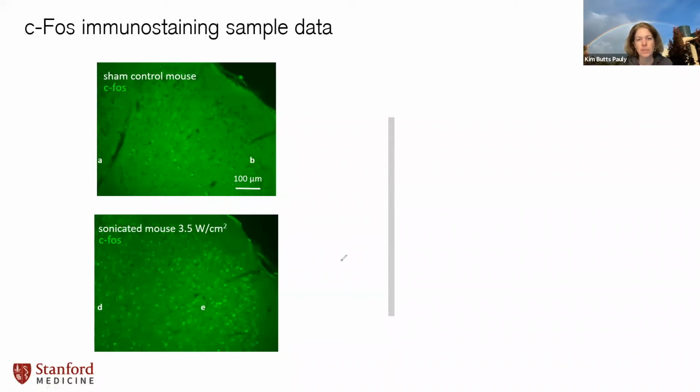And then we went through a phase of quantitating that using NIH ImageJ. You could take a large region of interest and look at the fluorescence, or you could try to just quantitate the number of cells. ImageJ has capabilities for segmenting out and quantitating cells. I'm glad you mentioned that, because earlier we showed the students how you can threshold an image.